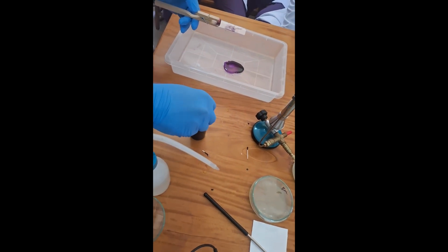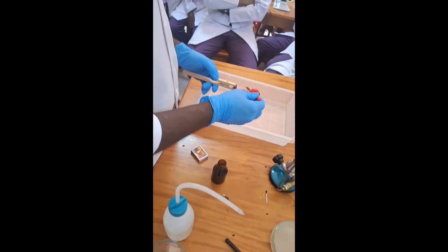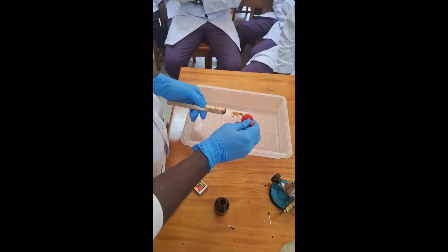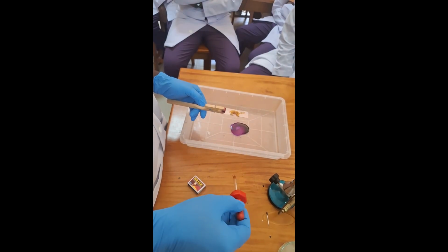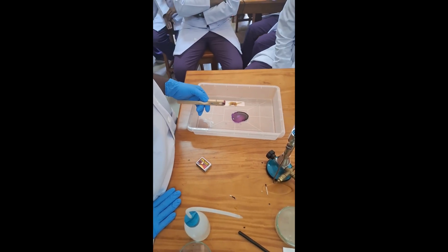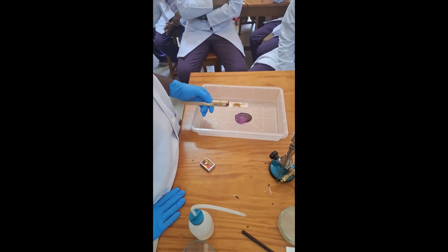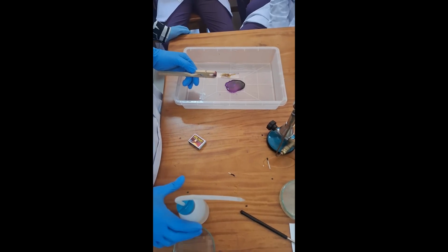Add Gram's iodine and leave for 1 minute. Gram's iodine forms a complex with crystal violet, making it less soluble, so Gram-positive bacteria retain the dye during decolorization. Wash with tap water for 5 to 10 seconds.